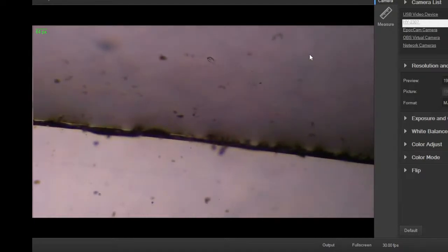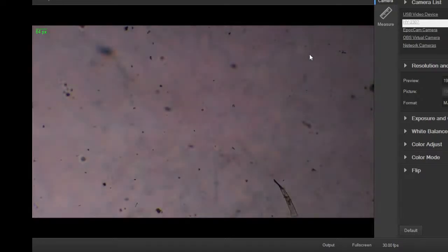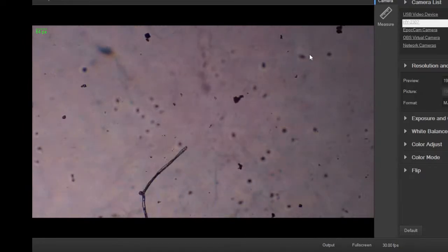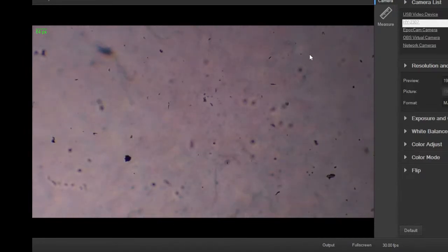My optics are a little bit dirty here. I gotta clean these things. So, when I first turned this on, I saw something, but now I have to go find it because it's swimming around pretty fast. Lots of little debris. No swimmers here. Oh, wait a minute, did I miss something?